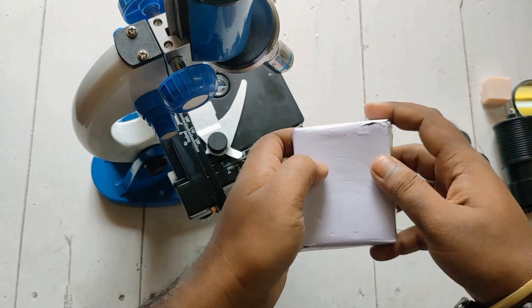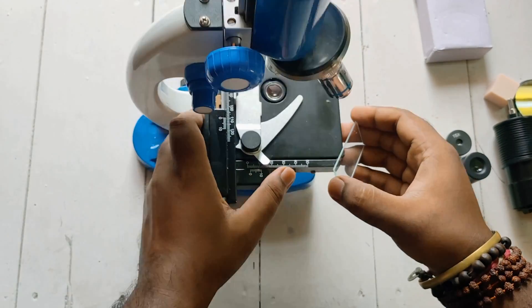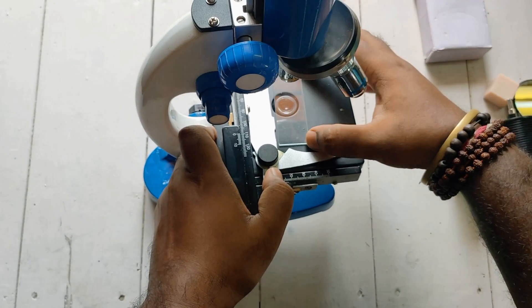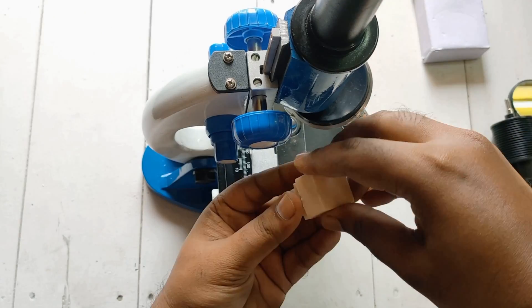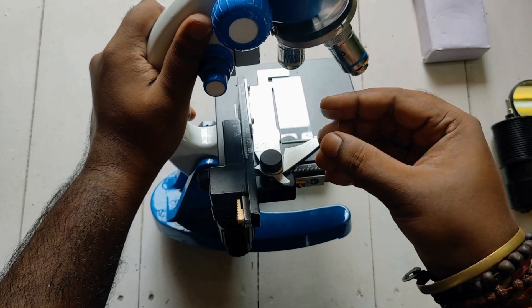After making the slides, you need to pull this trigger and place the slides like this. This cover slip needs to be placed here with a little drop of water on the slide.